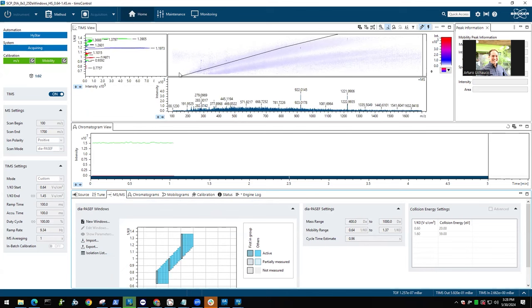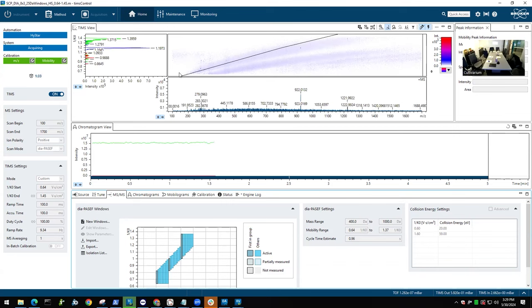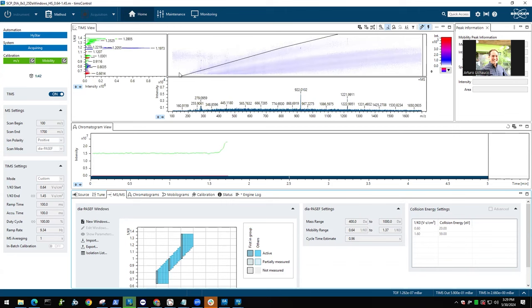It depends what the type of experiment is. When I run a dilution series, I always start at the lowest, work my way up, and then I do a couple of blanks afterwards to make sure that everything is washed out. When I run single cells, I typically try to have blanks between different conditions. Because with single cell the carryover should be really minimal, but if you have 10x reference runs and cells or something like this, then I would recommend to run some blanks just to make sure that you're not inferring some information from the run before. And also sometimes it's good to have a blank to check what your background is. Sometimes you have your samples sitting around and something starts growing in there, so it is good to know what your actual background is.